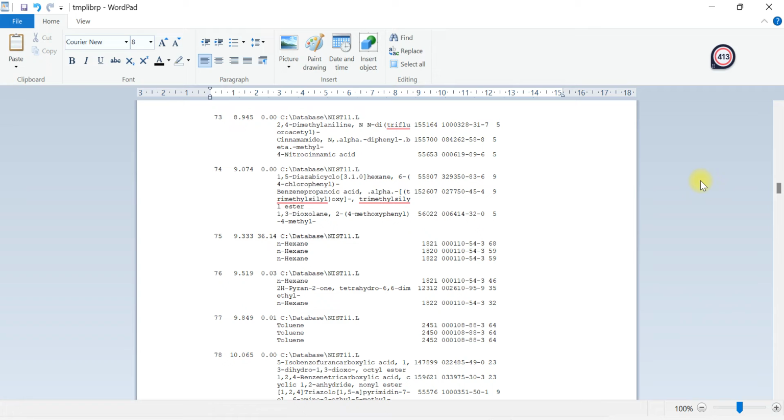So there is some possibility of unknown, or the library is not that updated. But usually people don't report that the library is not updated. We just say that it's unknown. That's it. Yes, so if every run has it, you have to investigate. So that is your master's or PhD. We have an expert here. But it is indeed a struggle on that part.